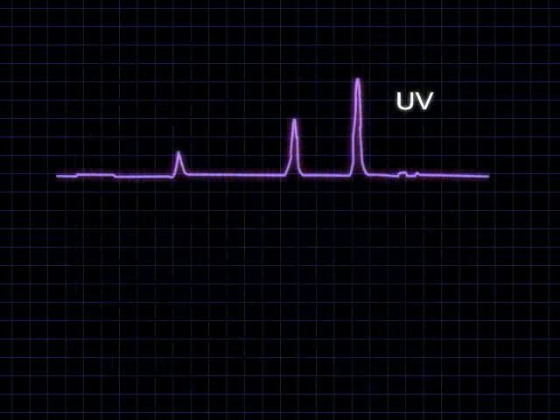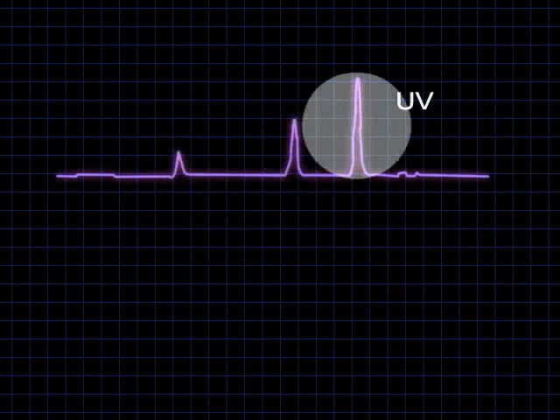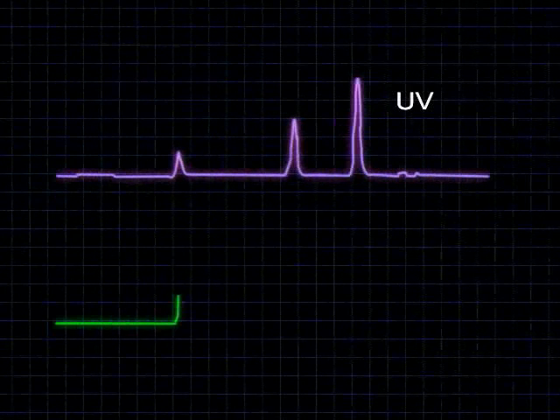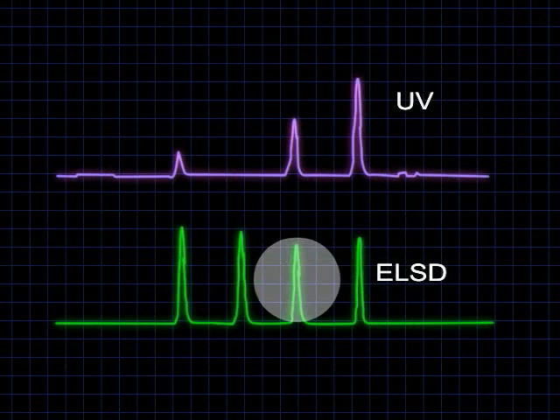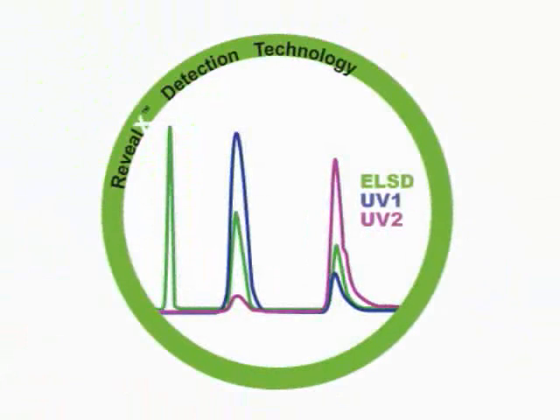A crude mixture containing equal amounts of four organic compounds poses a challenge for determining the targeted compound's relative purity. In this reversed-phase HPLC analysis, UV detection reveals only three compounds. Unfortunately, purifying by UV triggering leads to impure target samples and false concentrations in bioassays, causing truly active targets to never be identified as hits. However, evaporative light scattering or ELS detection reveals the sample's relative purity and impurities undetected by UV systems.